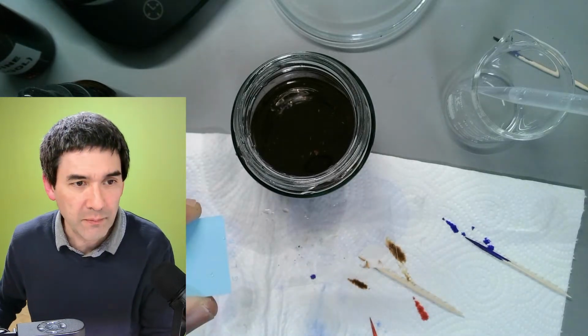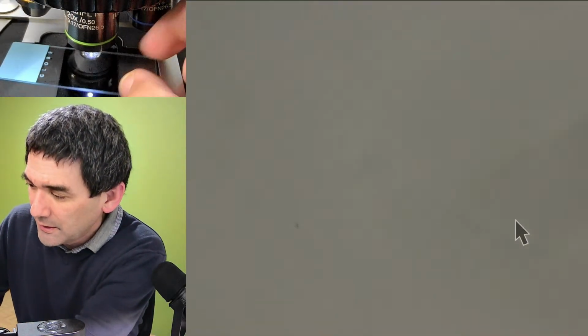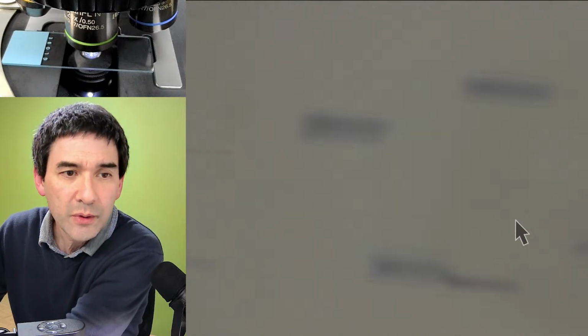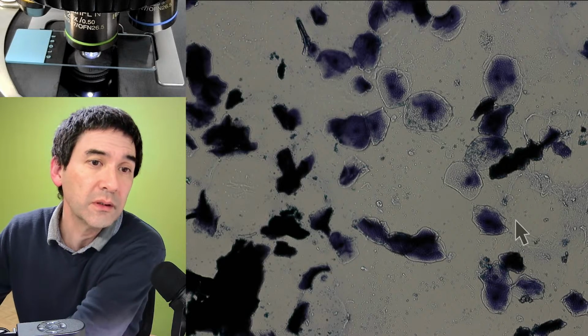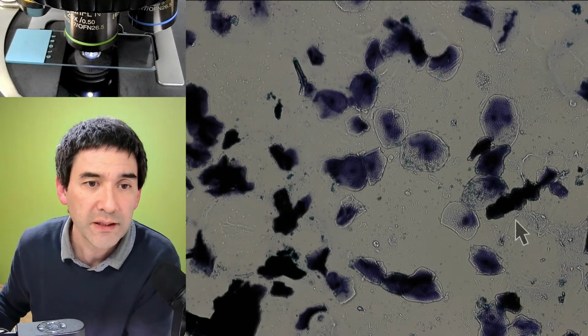Okay, so this is now the de-stained one. Where is the scope view? And let's have a look. Ha! What is this? Where is everything? Ah, look. De-staining not quite complete yet, but it's actually also quite nice.